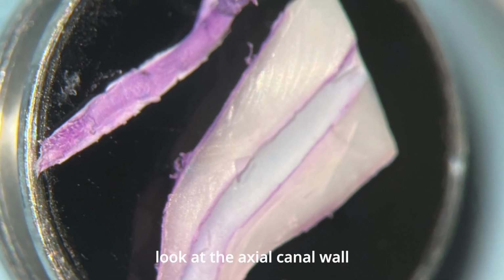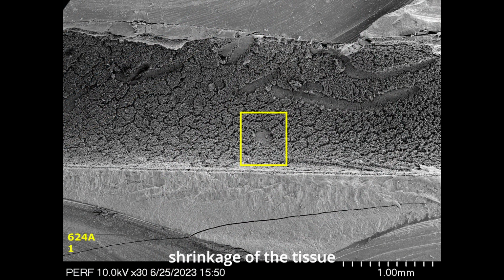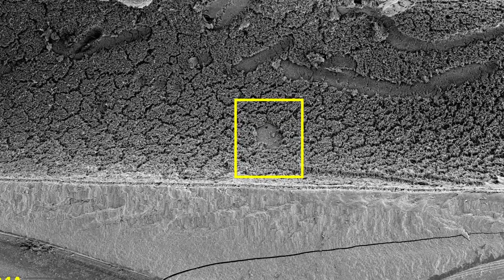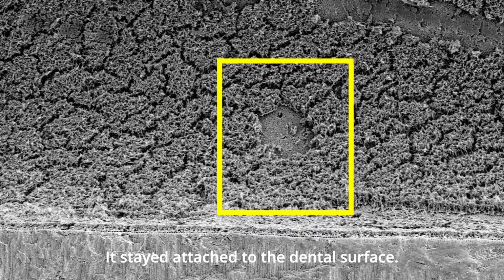And then we're going to look at the axial canal wall and see what this looks like. So you can see here, there's quite a bit of shrinkage of the tissue. And that's where all the cracking is. It's from the dehydration. And you can see that the predentin is still attached to the surface of the canal and was not removed with the desiccated pulp. It stayed attached to the dental surface.